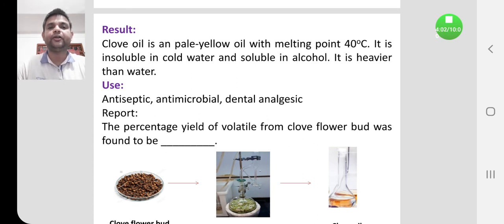Overall, what we have learned from this experiment is that clove oil is extracted from the clove flower bud by using an apparatus called the Clevenger apparatus. The principle involved here is the hydro steam distillation method.